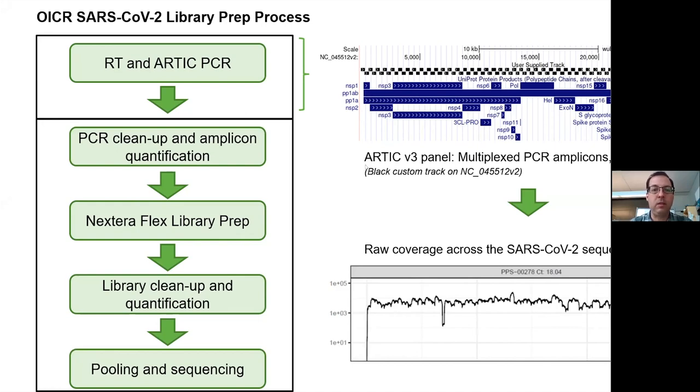So basically, this is a rapid way of reducing an RNA sample to raw coverage, shown here across the SARS-CoV-2 sequence. There's obviously some variability because there's variability in each of the amplicon performances, but all in all, you can see that usually, if everything goes well, the whole genome is covered quite deeply, and certainly enough to call variants across a sample that's essentially haploid.